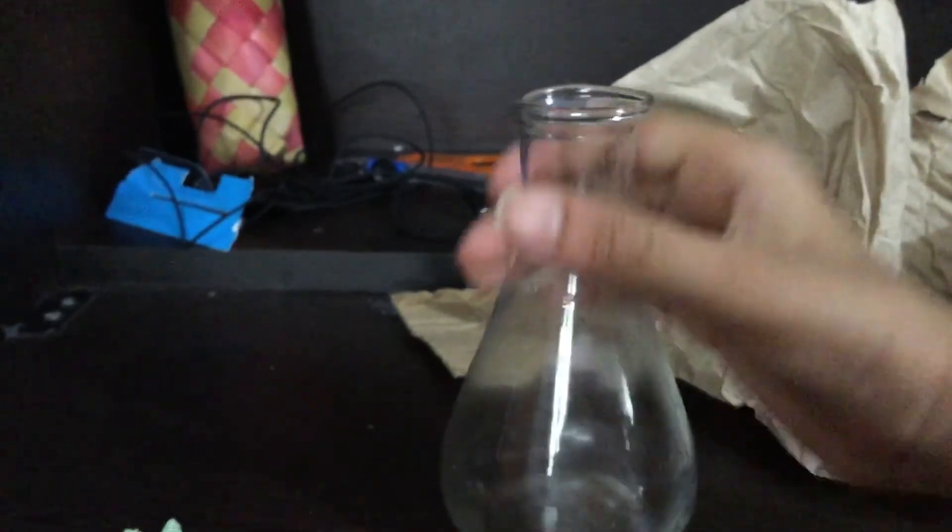The second item — I'm not sure what it is at first, but now I understand it's a conical flask because it's a cone-shaped flask with a flat base, used for mixing liquids or storing them. Yeah, I was right — it's a conical flask made of glass, used for mixing or storing liquid. It's very cool.